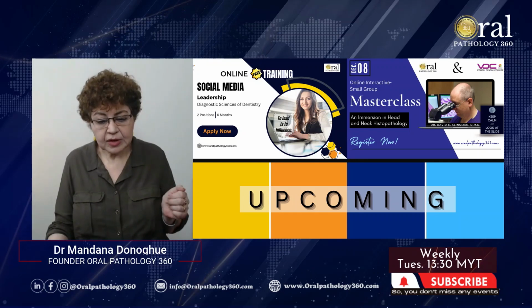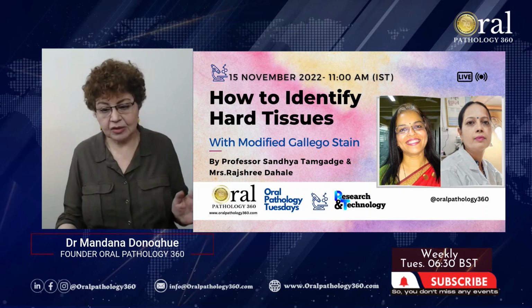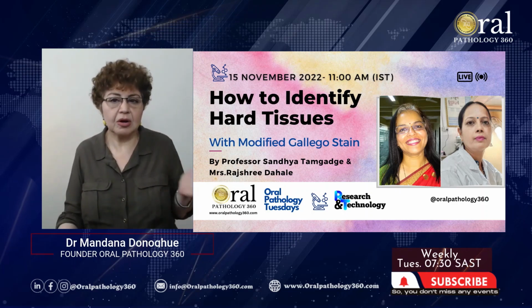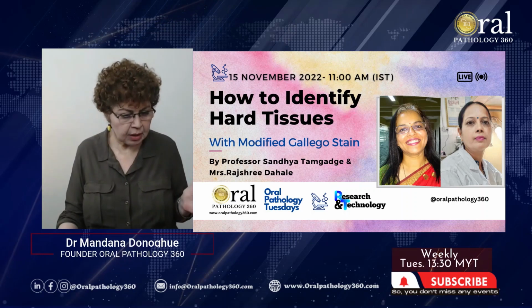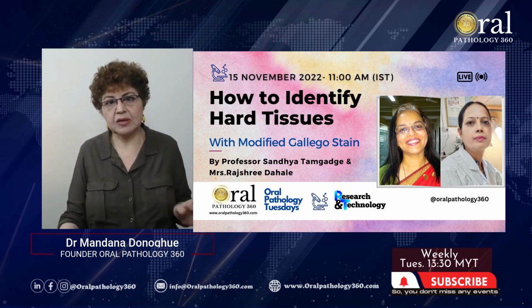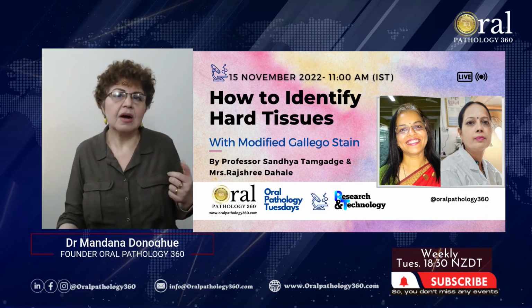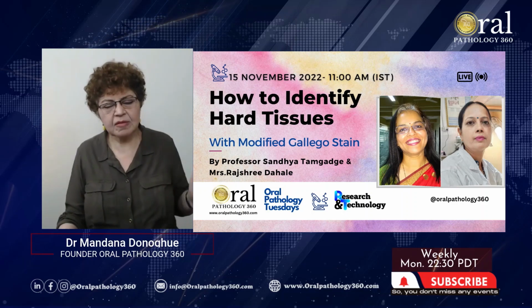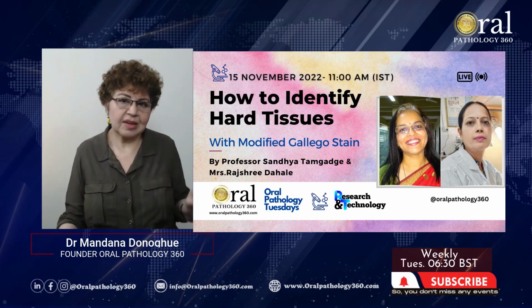Now, coming to today's program, today we have how to identify hard tissues. We know, of course, within dentistry, we have a lot of hard tissues, and it is one of the most important things remembering how to identify those. And sometimes it's not as easy as it seems because they can look alike and it's not very easy to differentiate all of them. So today we have a special stain, a modified Gallego stain in our technology session.